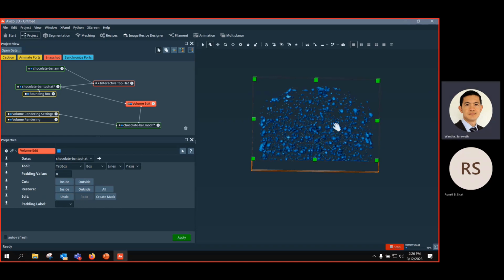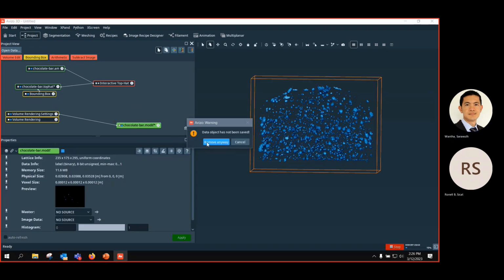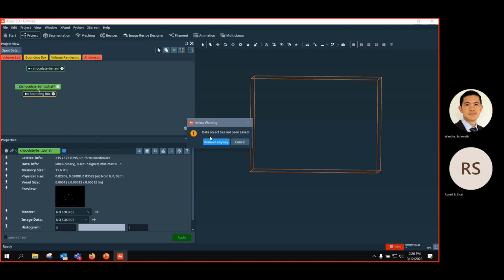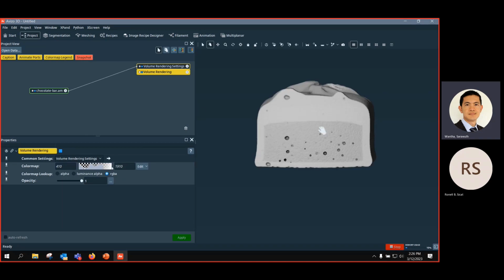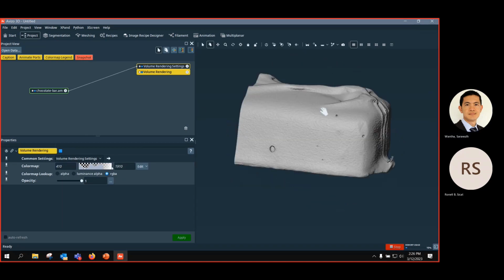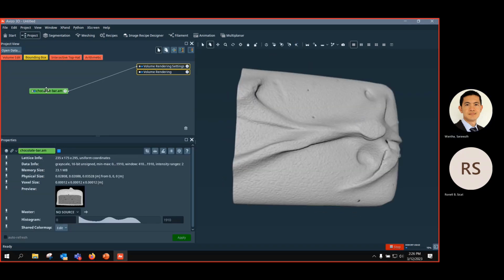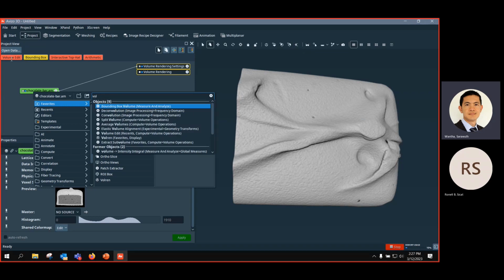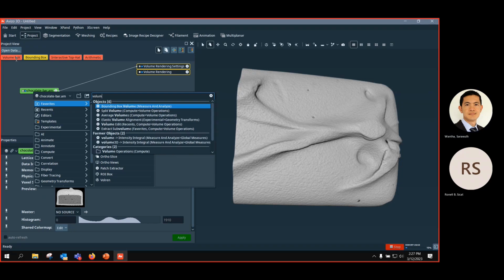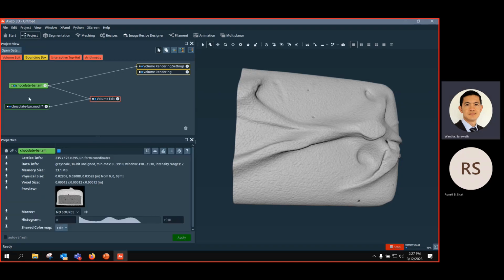Okay, maybe instead of this result, we go to the full volume and then work on it more easily, like this. Go to the chocolate bar from the beginning, and you can add volume rendering to the chocolate bar like this. So let's try first with the perspective view, and we add volume edit. So right click volume edit, or just activate it from the side if you already did it. It comes automatically with the result, so you can look at the result right away.